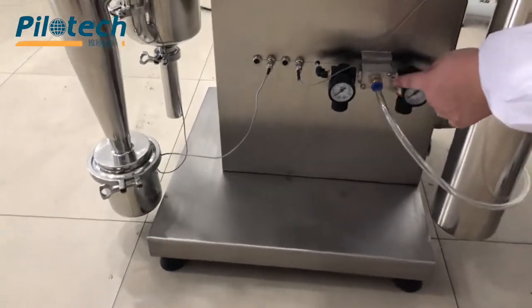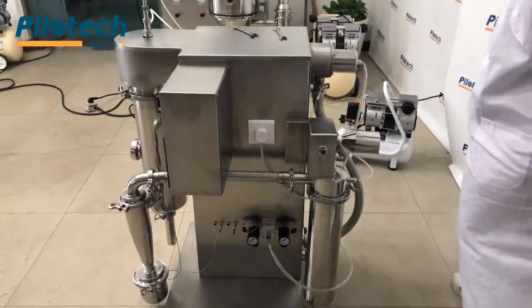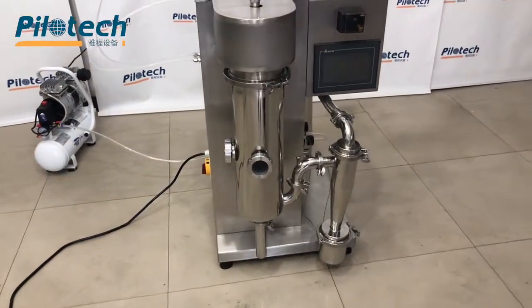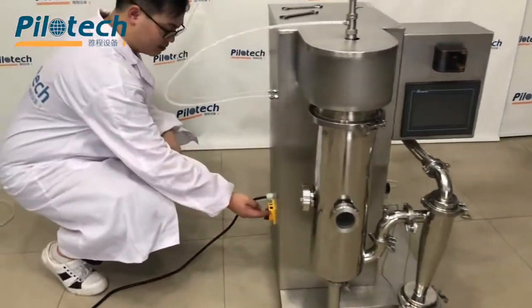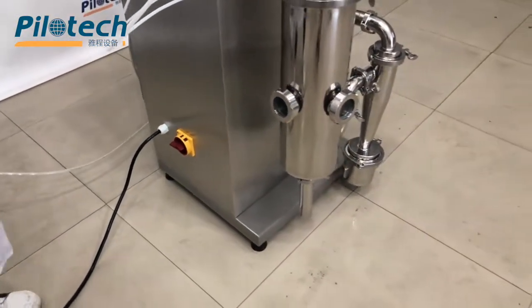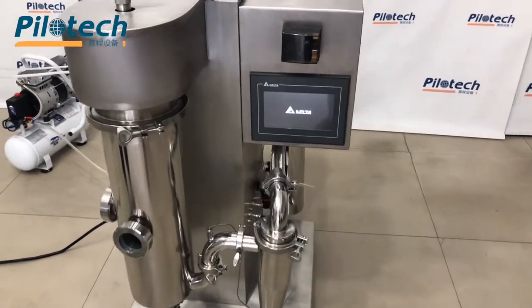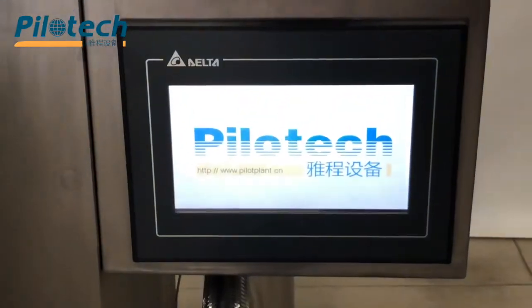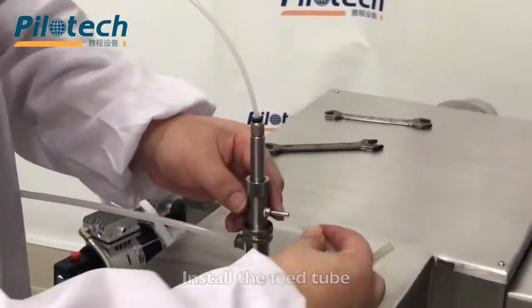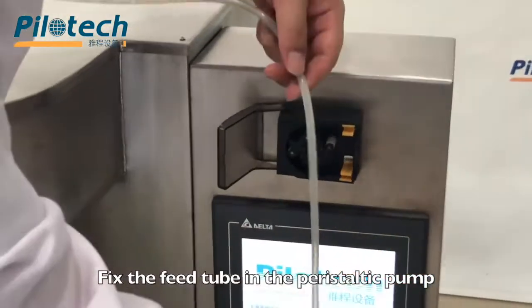Connect the compressed air tube. Turn on the main power switch. Install the feed tube and fix the feed tube in the peristaltic pump.